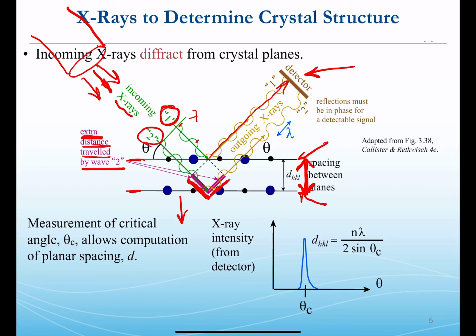So clearly some of the angles upon which we impose our radiation onto the surface of the sample are important. So we'll be using theta, or theta C, for that. And we've seen that the parameter, in this case the distance between planes, given symbol d_hkl, is another important feature here for satisfying the amount of extra distance traveled, and how important that is for satisfying constructive or destructive interference. Okay, so these are some important features that we're going to see in our derivation of a law that will help us predict when constructive interference will occur.